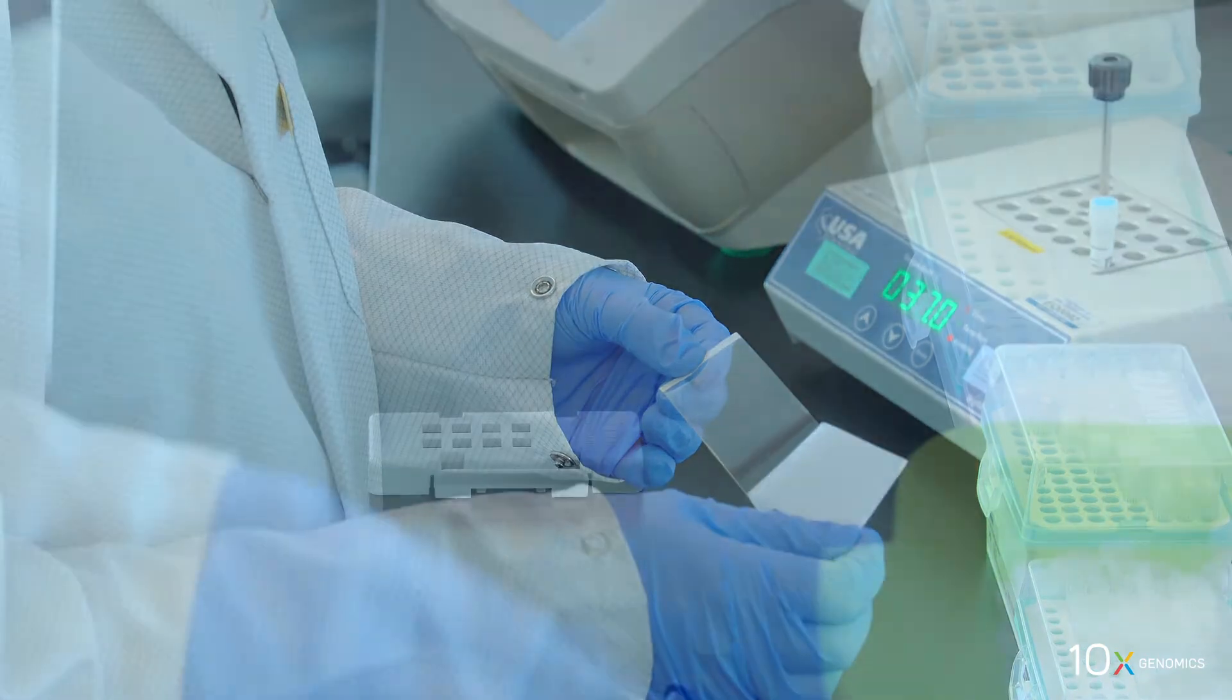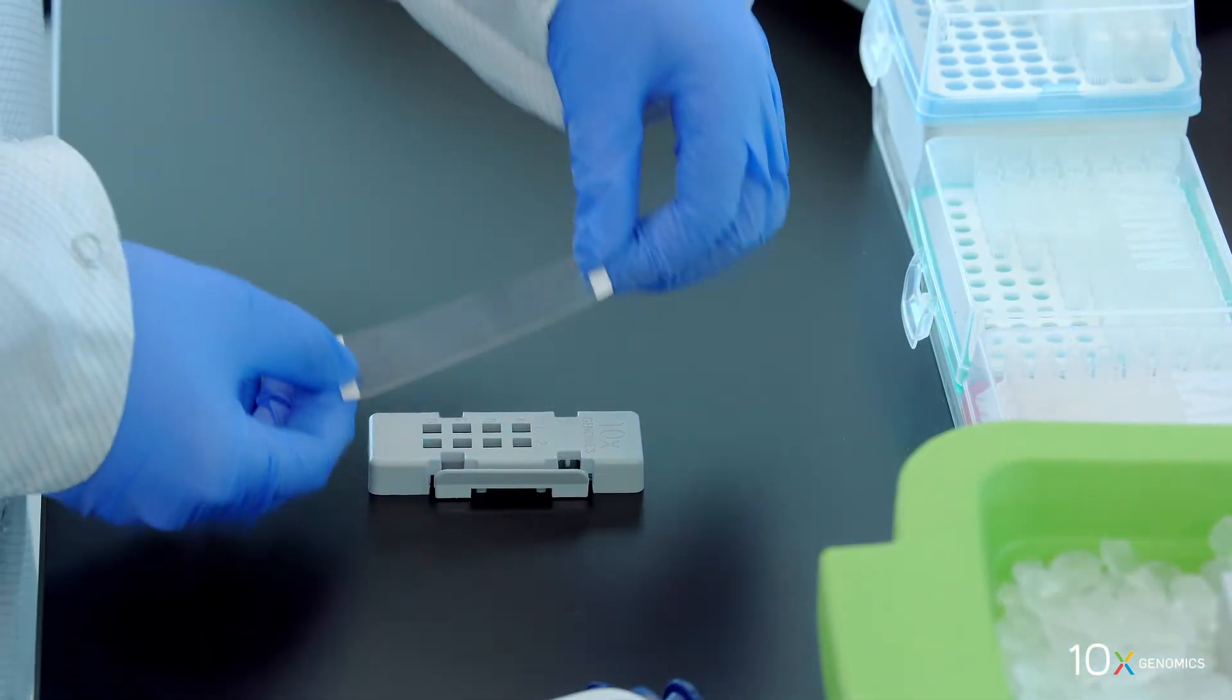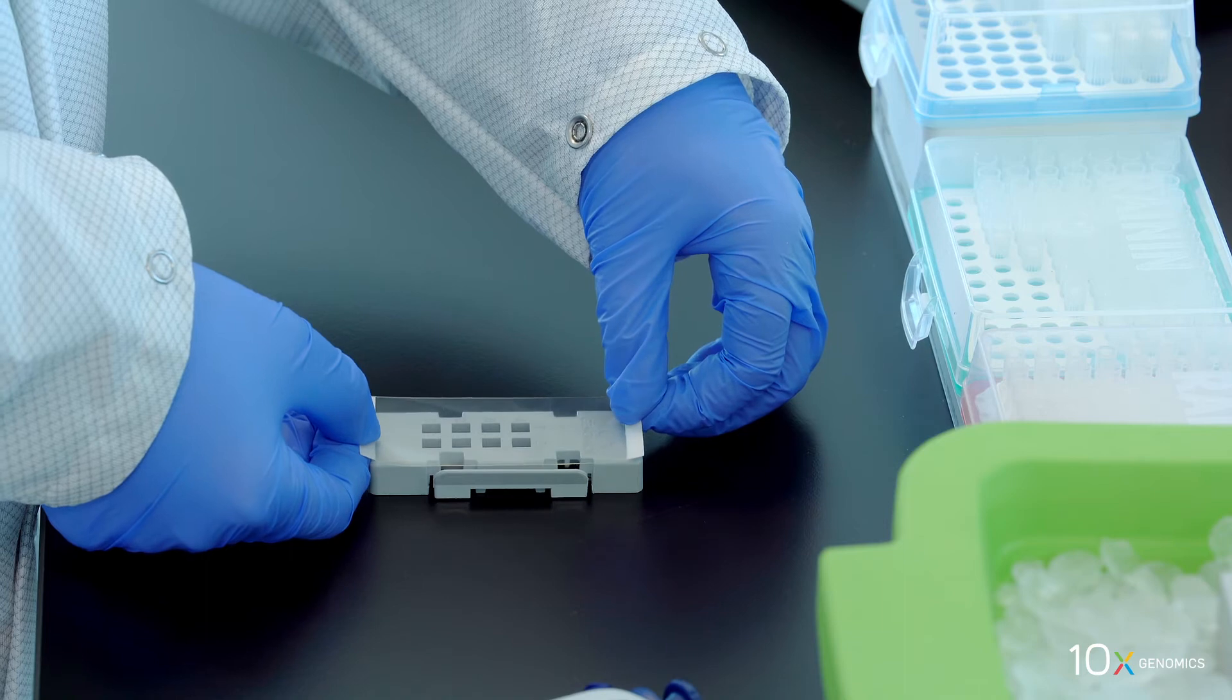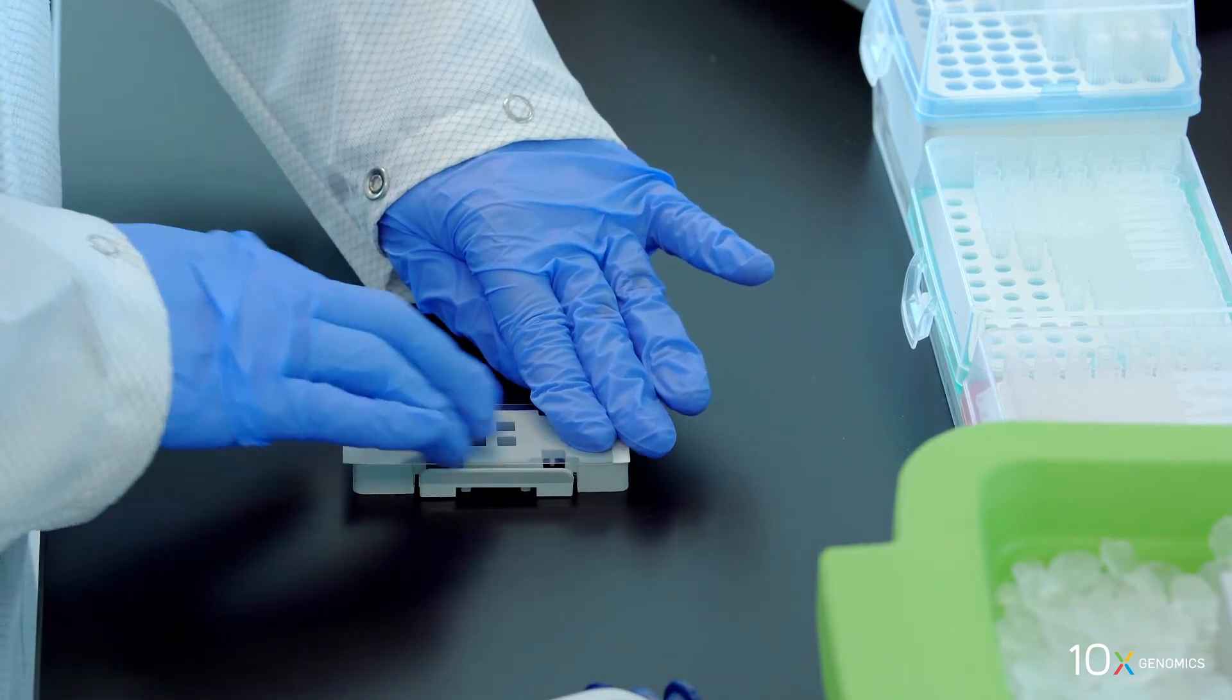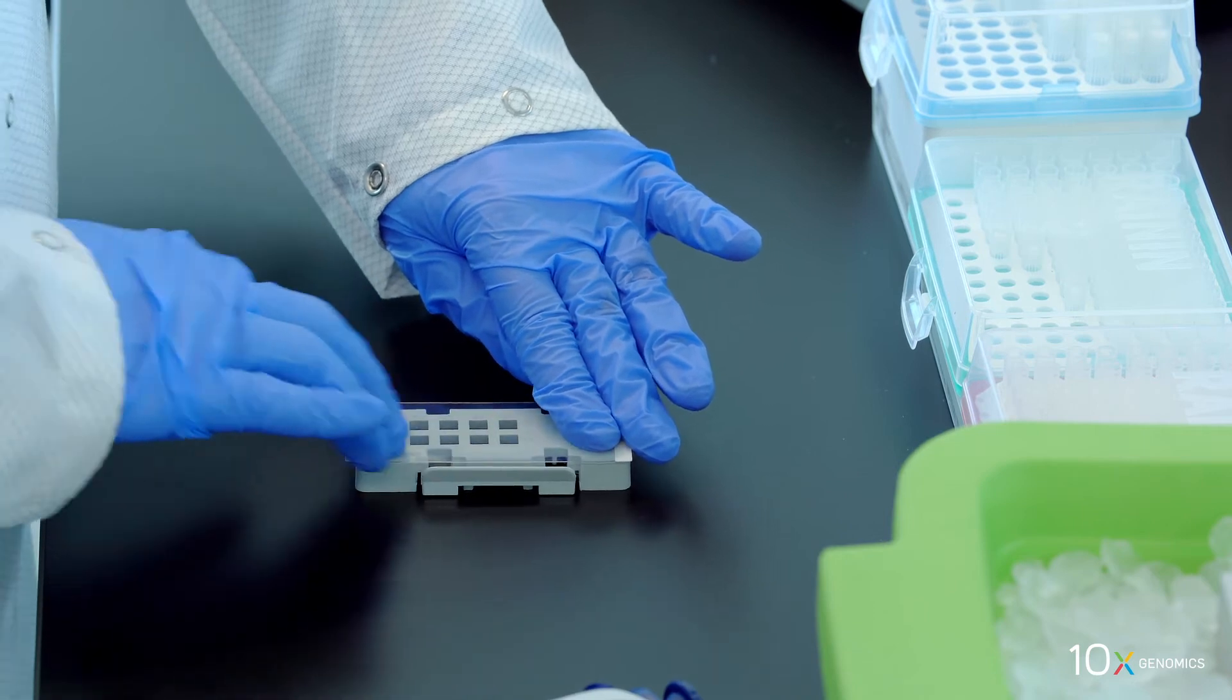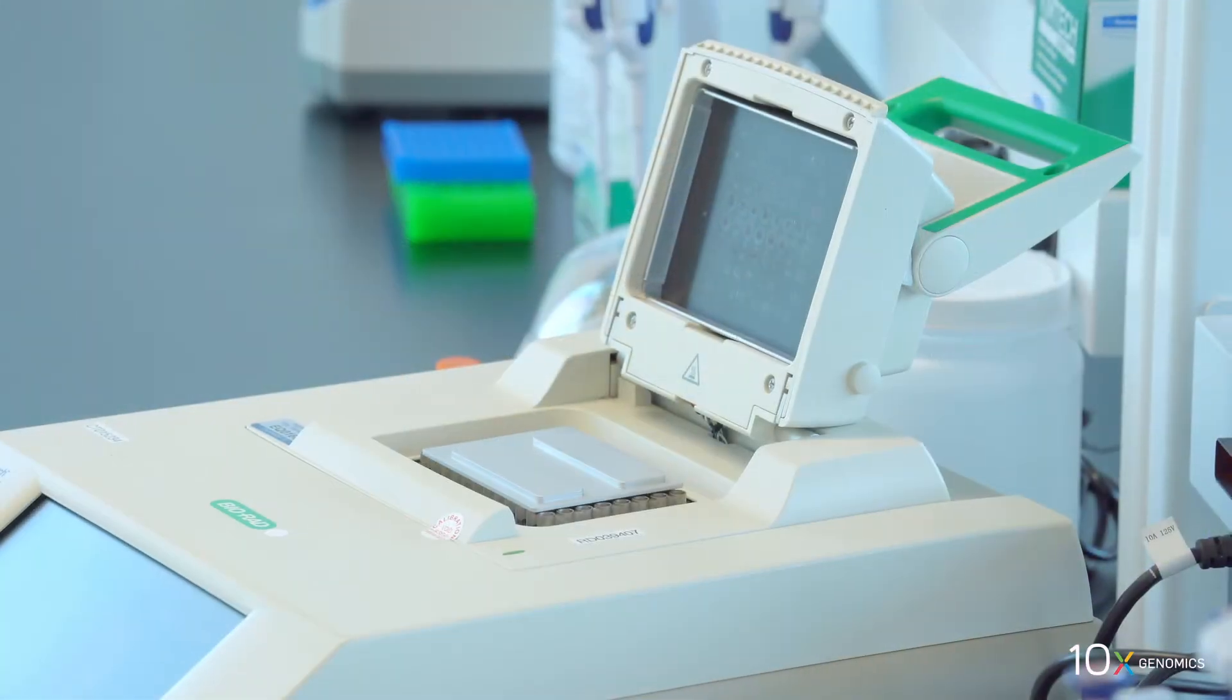Align the slide seal with the surface of the slide cassette and apply while firmly holding the slide cassette with one hand. Press on the slide seal to ensure uniform adhesion. Place the slide cassette on the thermocycler adapter at 37 degrees Celsius.